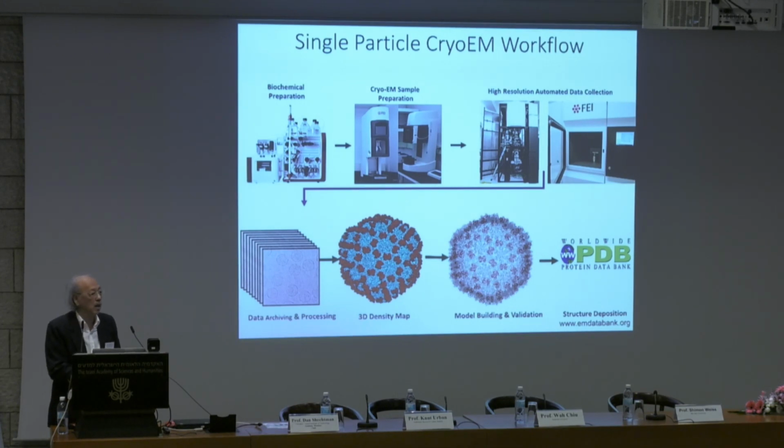What I mean by damage is chemical bonds broken, atoms moved around, and they get sucked into the vacuum. The second method in reducing the damage effect is to keep the specimen at low temperature. So even if things are damaged, they don't move, and you can still see the remnants in the electron beam. So this is a typical low-dose image of the frozen hydrated specimen in the electron microscope. All these are projection images. I cannot show the images we saw a while ago, with high contrast from every atom, from atomic number 1 to higher numbers. These are actually biological nanomachines.